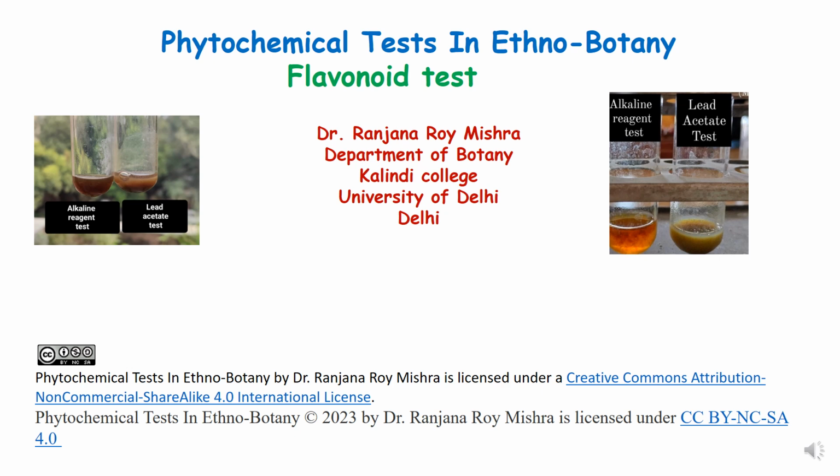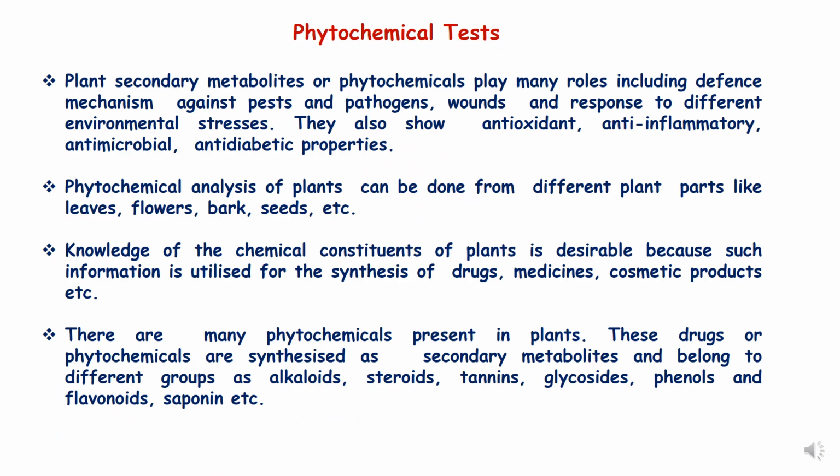Hello students. In today's lecture, we are going to discuss the flavonoid test performed in ethnobotany practical classes, and this comes under phytochemical tests in ethnobotany. So let us revise what phytochemical tests are and what phytochemicals are.